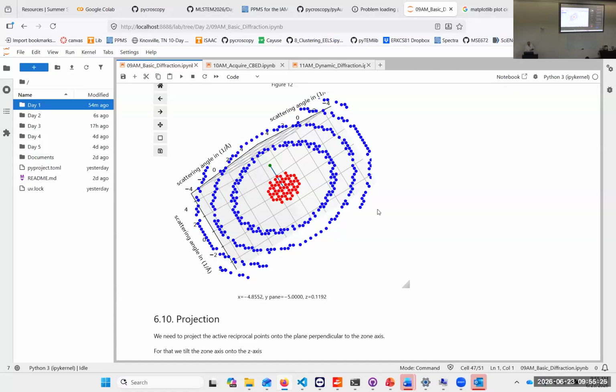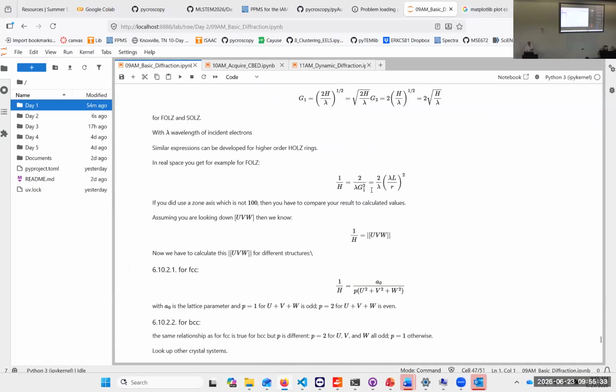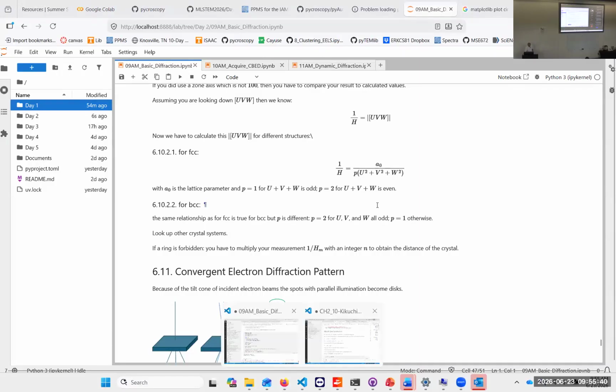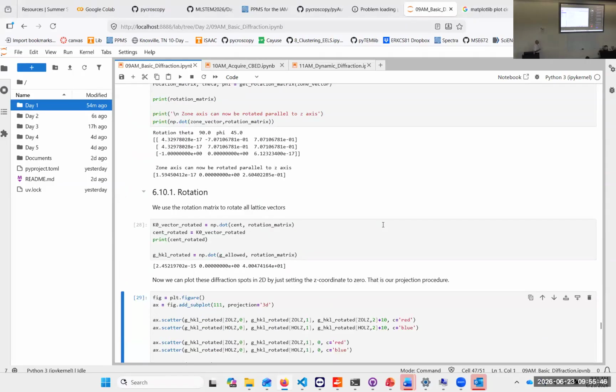And on the microscope, everything is a little bit easier. You can see that directly. And we should have plotted, say, a diffraction pattern here. So we want to see the convergent beam pattern in the microscope. And we want to see these Kikuchi lines. Okay.